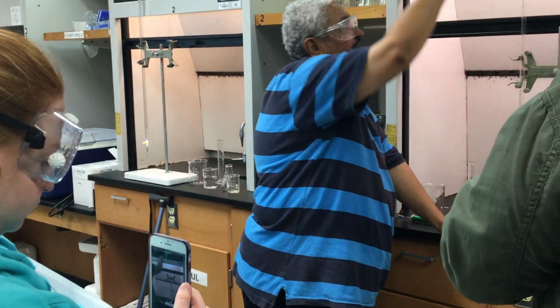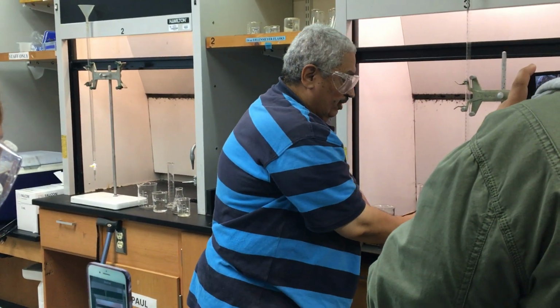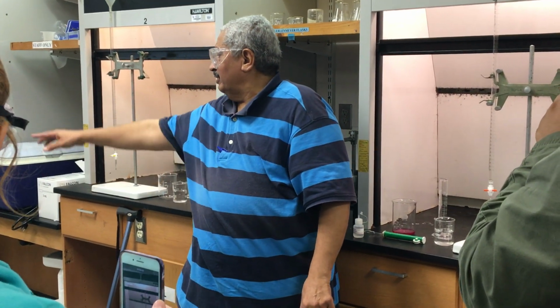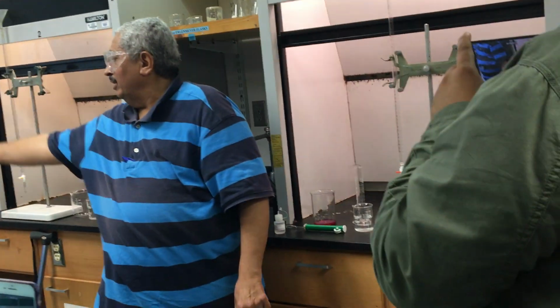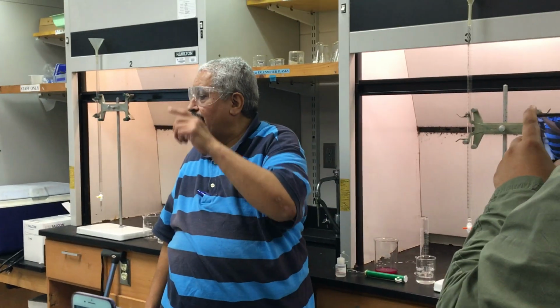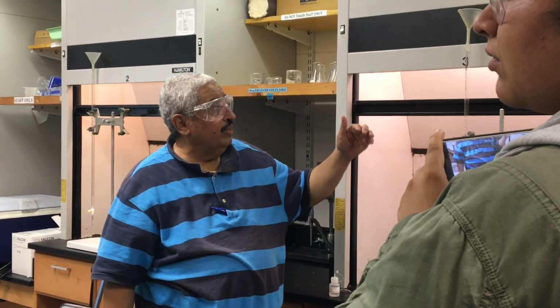Now you can see this is very hard for me. I might spill on myself. So it's better here to have a small tiny stool. Maybe a small tiny flat stool here. One of the stools here, the small flat one. Not the large one, the big one, the small one. Small stool, because I want to see the level.